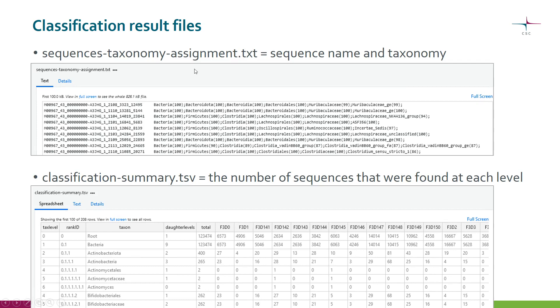Let's look at the result files. The sequences taxonomy assignment file essentially contains the sequence name and then the taxonomy assignment. Here in the parentheses you can see the confidence scores, and as you can see there are no numbers less than 80.